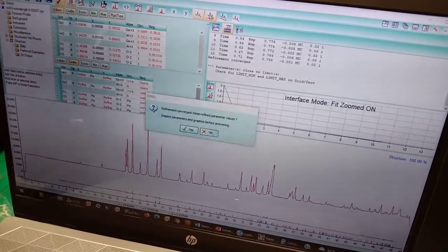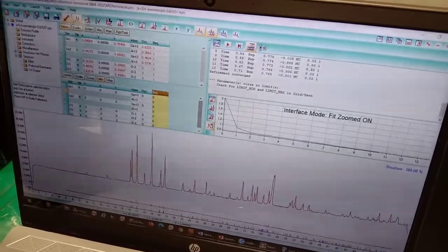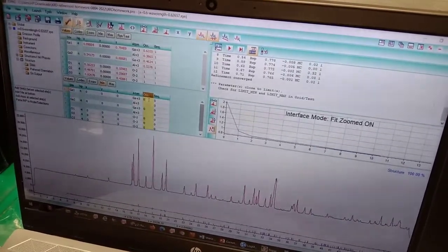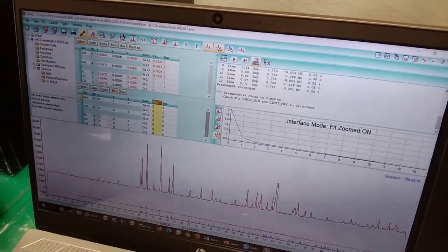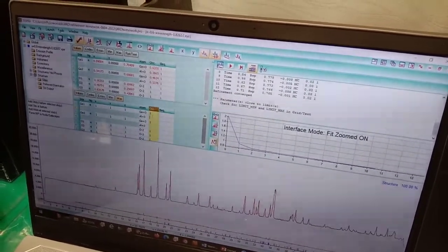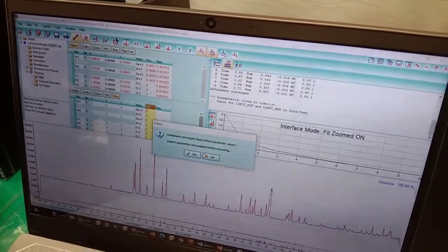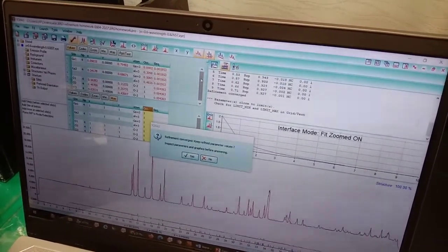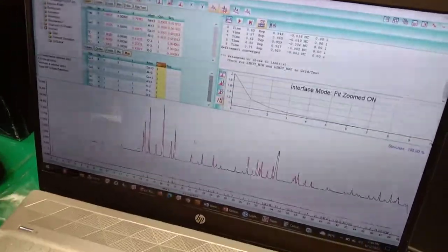Now it is still 0. Oh, I just set this. Okay. Maximum. Okay, now I just refine it again. Okay, something like this.